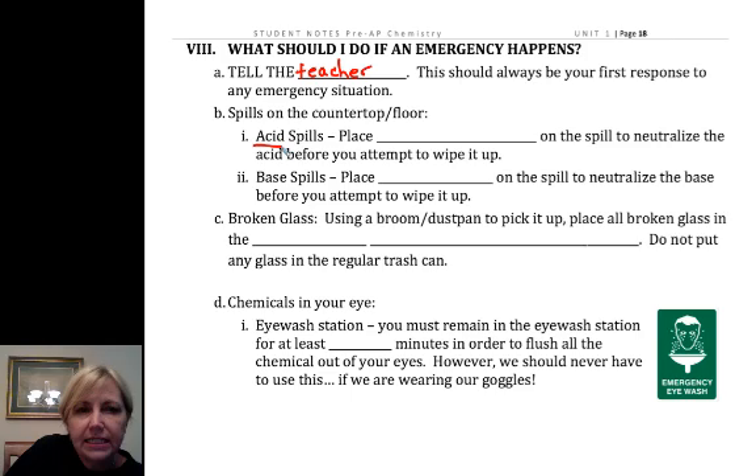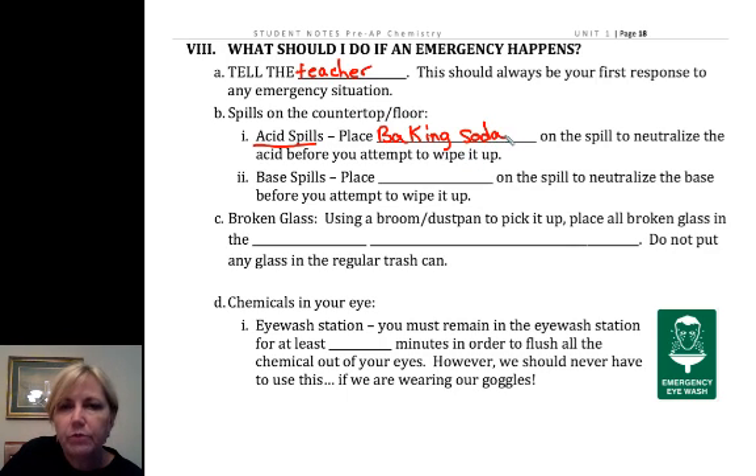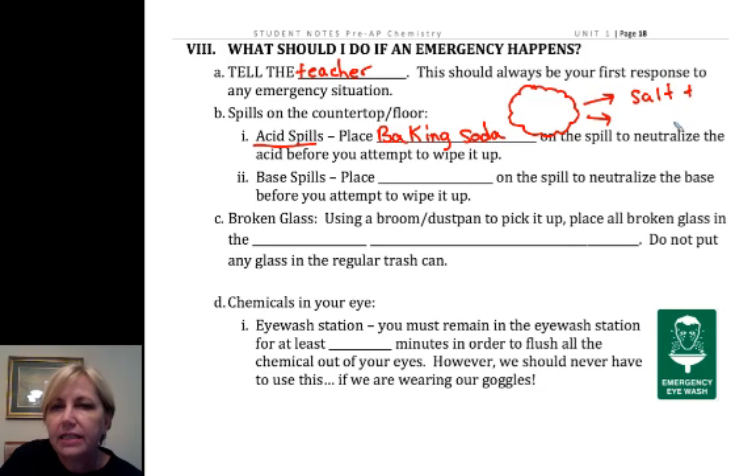If there's an acid spill, grab the baking soda. I have some special acid spill material that we buy, but by and large this is the cheapest and most effective way. You take the baking soda and spread it around the edges of the acid spill to keep it from spreading out. What's really nice is you're going to make a salt plus ultimately CO2. CO2 is a gas that's going to bubble, and once you're done bubbling, you know that you've neutralized all of the acid.